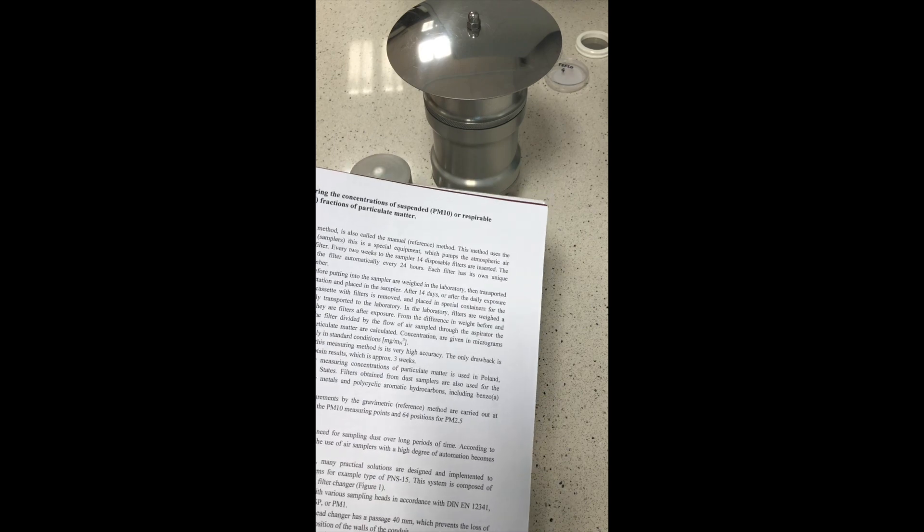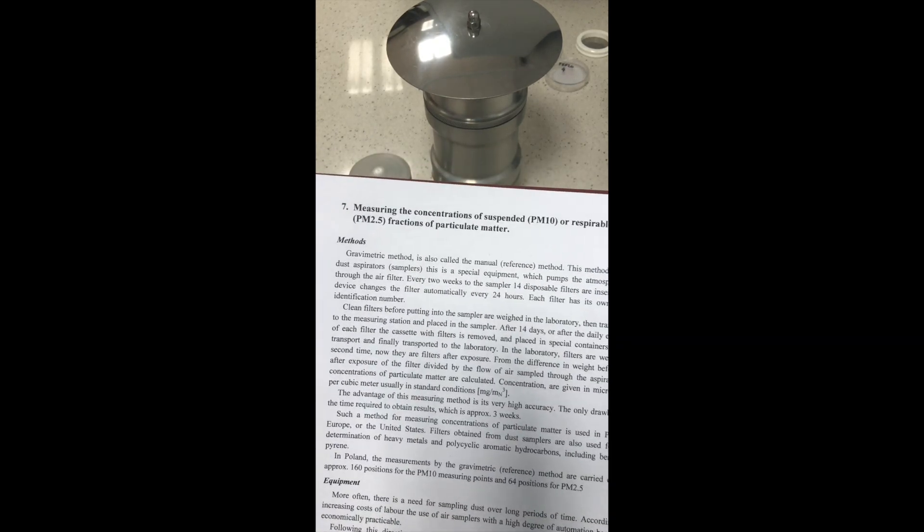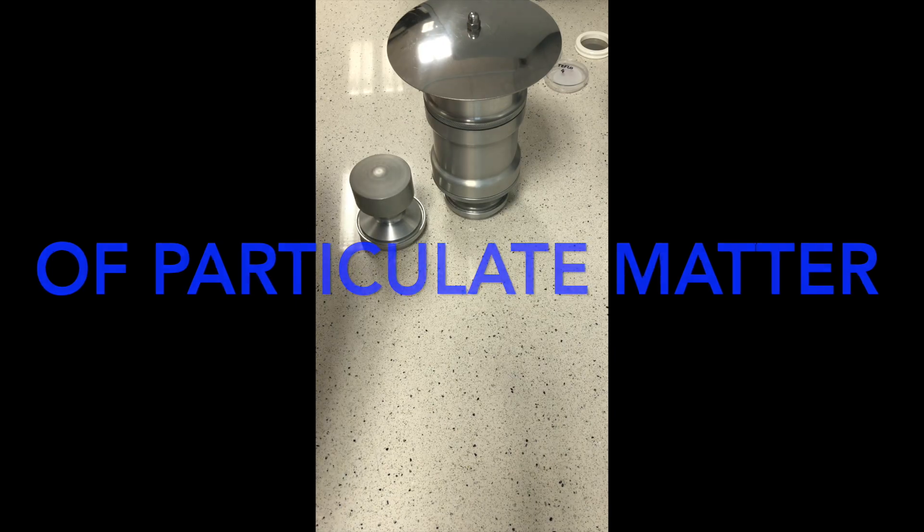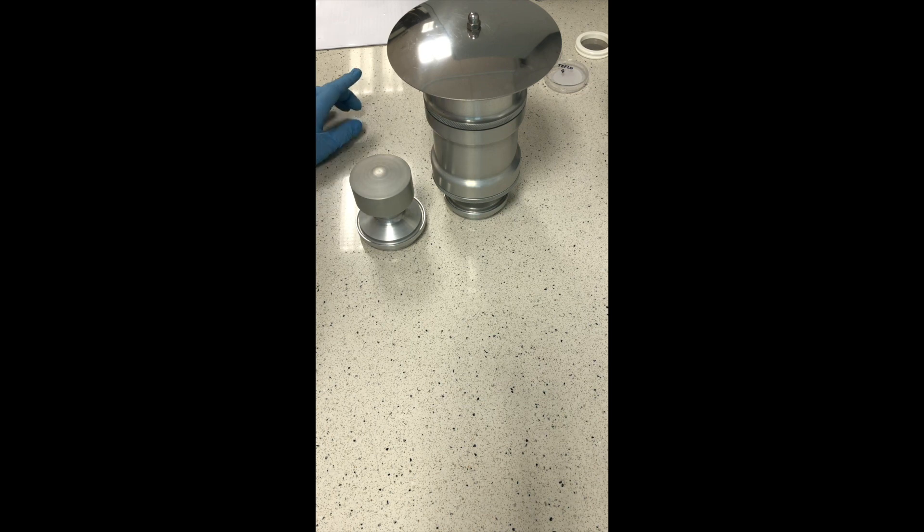The last exercise on our list is measuring the concentration of suspended PM10 or respirable PM2.5 fraction of particulate matter. You probably know the difference between PM10 and PM2.5. PM10 is particles lower than 10 micrometers, and PM2.5 is particles smaller than 2.5 micrometers.